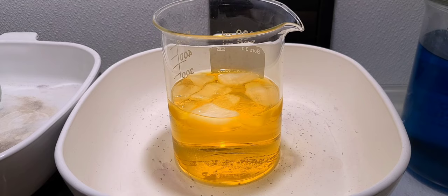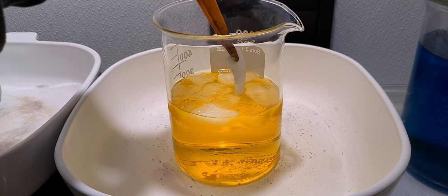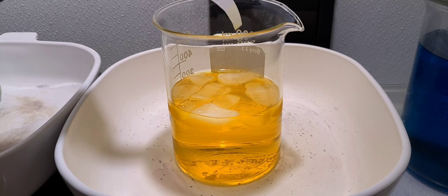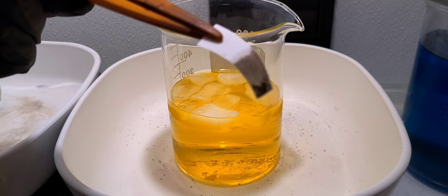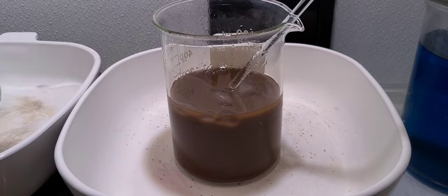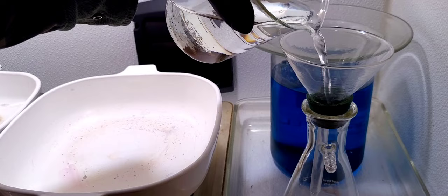I let it sit overnight and then we're going to filter it off here again. Now we have a very nice, clean solution. Again with the ice — an exothermic reaction is coming up — and we add that SMB. Let's test it with the stannous chloride. It's very important that you test your stannous chloride. I know there's gold in there, but it's important because when I go to test to make sure I drop all the gold out of solution, I want to make sure the stannous chloride is working properly. We dropped in the SMB again, dropped that gold back out of solution, retested, came up clean. I'm going to let that sit overnight, then decant that solution.